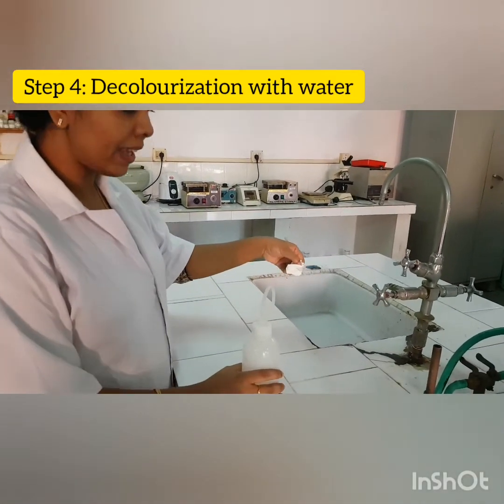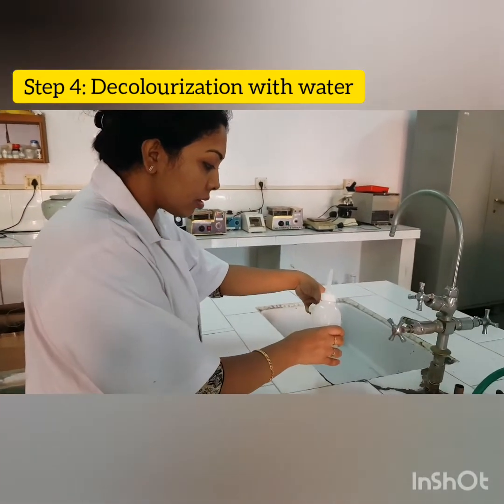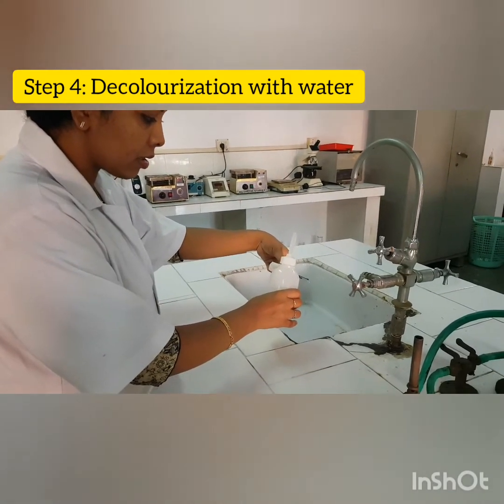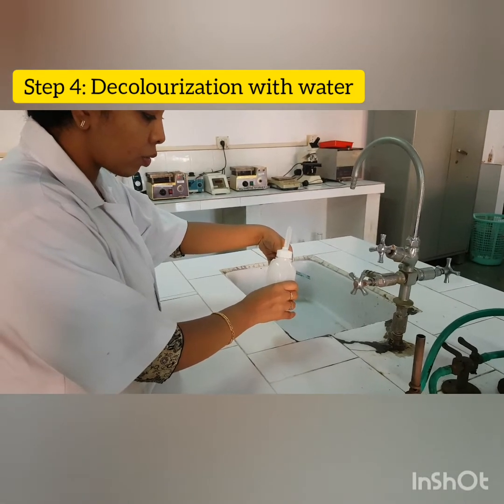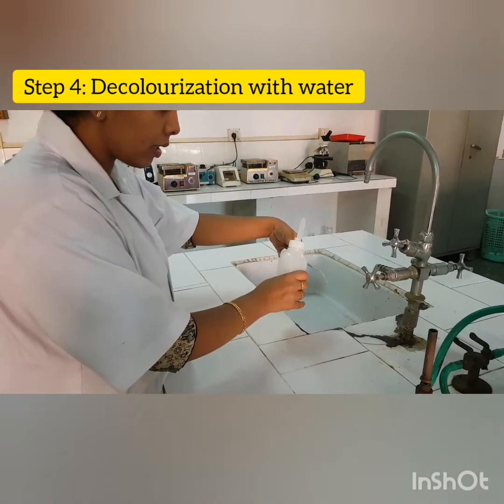After that we have to wash it with water as a decolorizer. So kindly, by tilting it, you have to wash it properly in order to decolorize it.